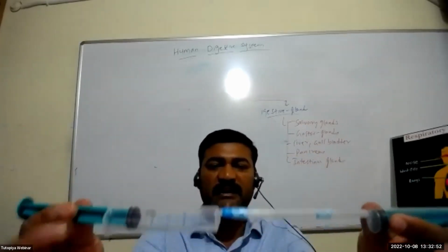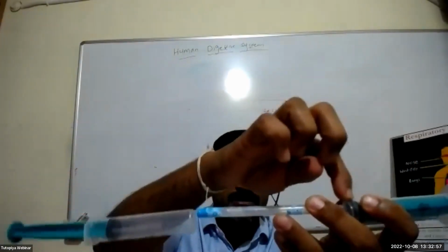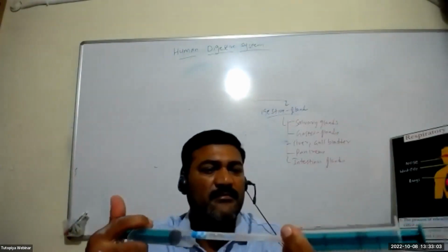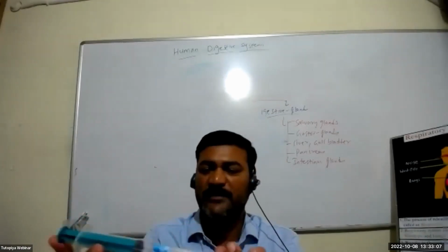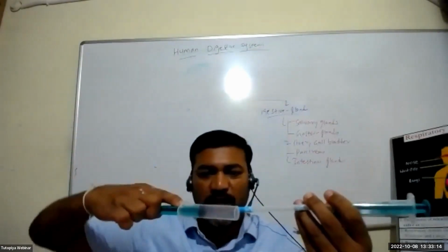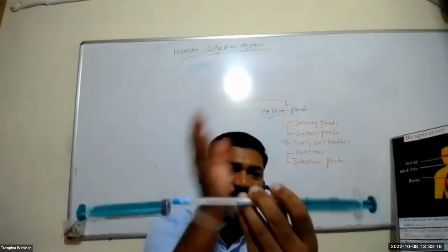First you have taken 100 ml, take 100 ml like this. Here this is 100 ml, but this is 0 ml, there is no air here. Now press this. There is actually some gap here, but when you press, all this 100 ml of air passes through this tube into this syringe, and again pull it out. The air again passes into this syringe, and again press it inside. Again the air passes into this syringe.